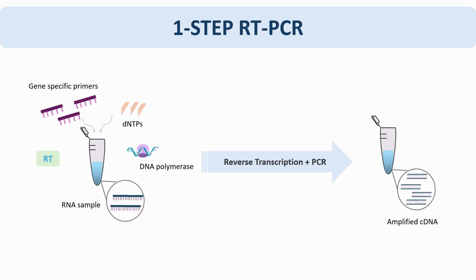First, reverse transcription occurs forming cDNA, which is then amplified in a PCR process. As both reactions are conducted in a single reaction tube, sequence-specific primers are used in this type. It is easy to carry out with a less handling. Due to a reaction in a single tube, one-step PCR is generally easy to carry out as it requires less handling.